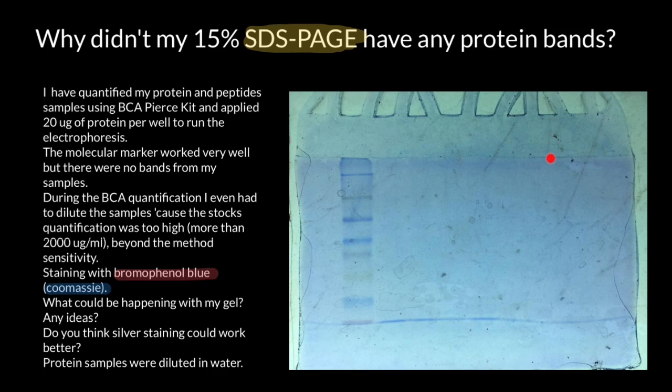Hence, there are no visible bands. What actually happened? We see nice bands in the ladder because a different dye was used there — probably the one that came in the kit — but we don't see any sample bands because bromophenol blue does not interact with DNA or protein molecules being analyzed. It simply aids in visualizing and tracking the electrophoresis run.